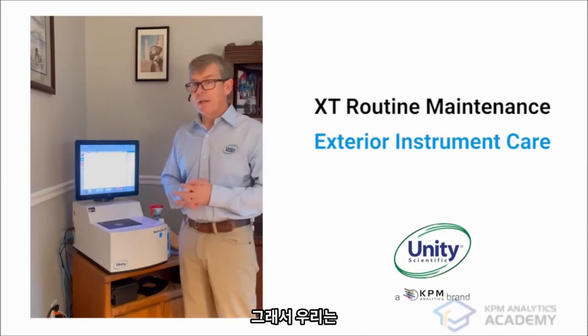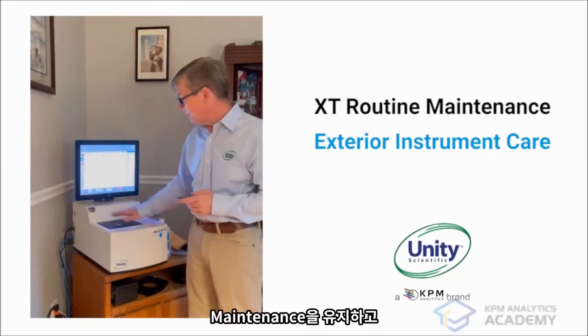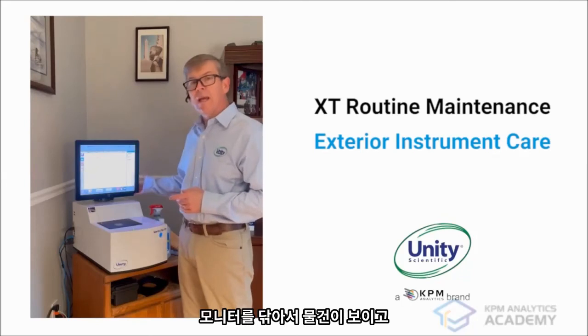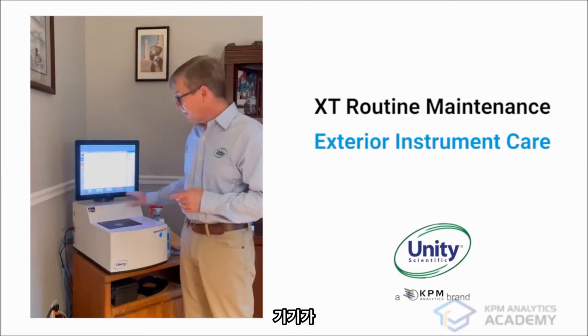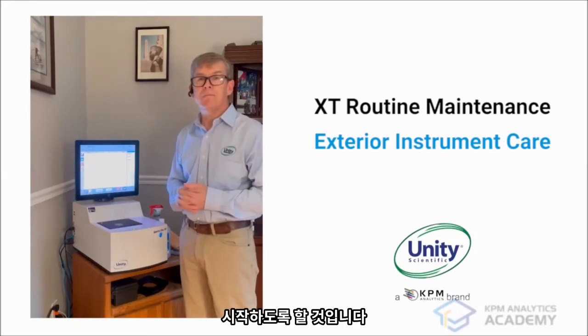So we would recommend that you keep your maintenance to the outside of the instrument and the sample presentation window and wiping down the monitor. That will keep your SpecstraStar looking good and performing well.